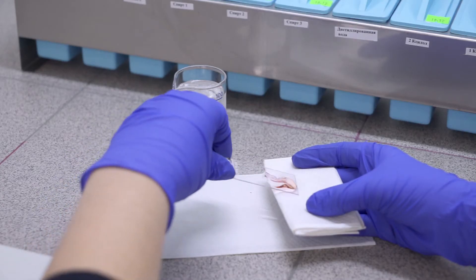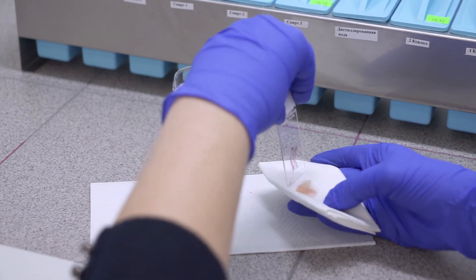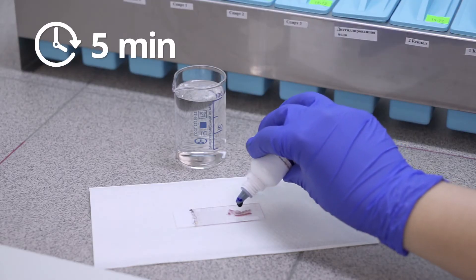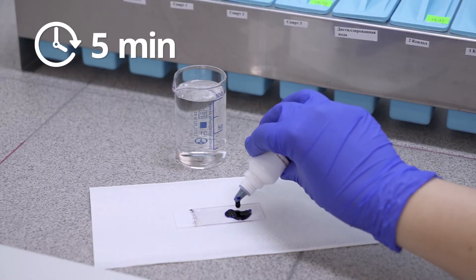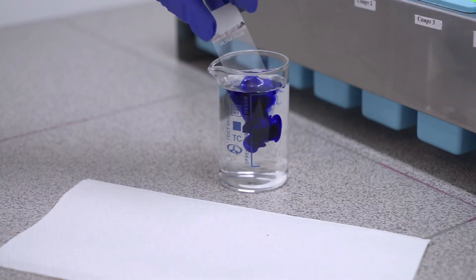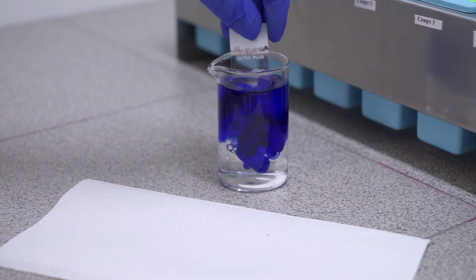Dry slides without washing and put on them solution F — Masson's Aniline Blue — for 5 minutes. Wash slides in distilled water and then dehydrate, clear and coverslip them.